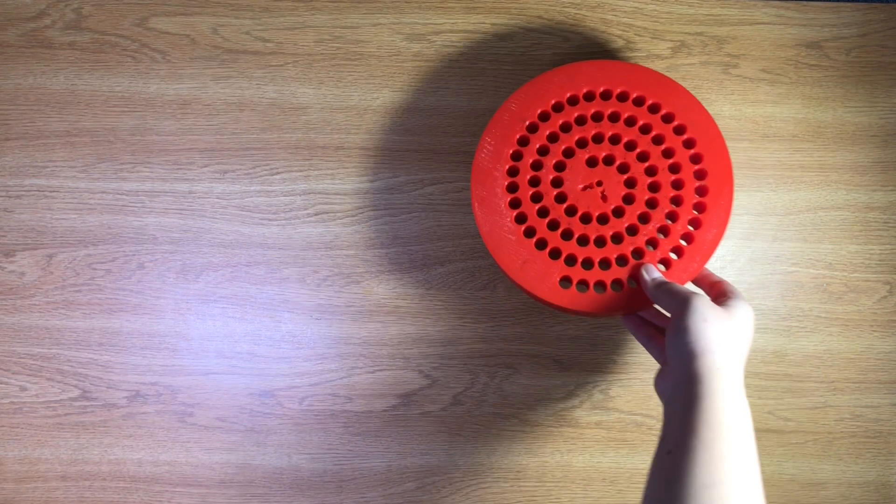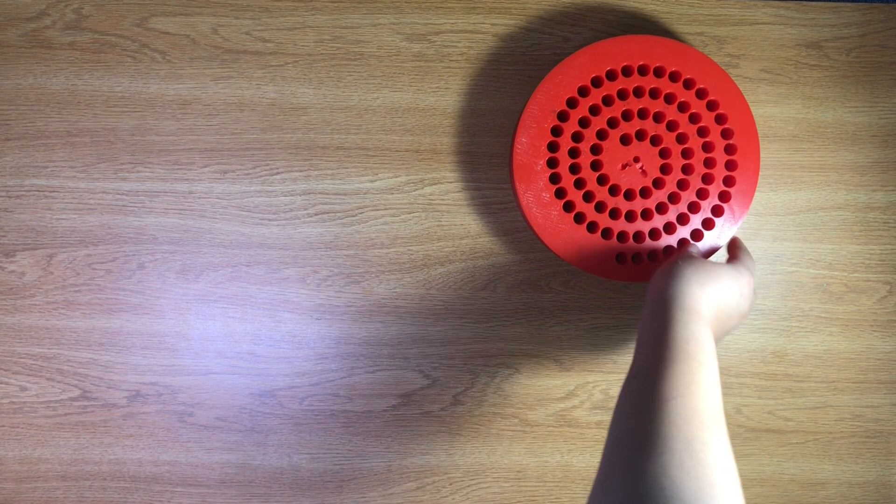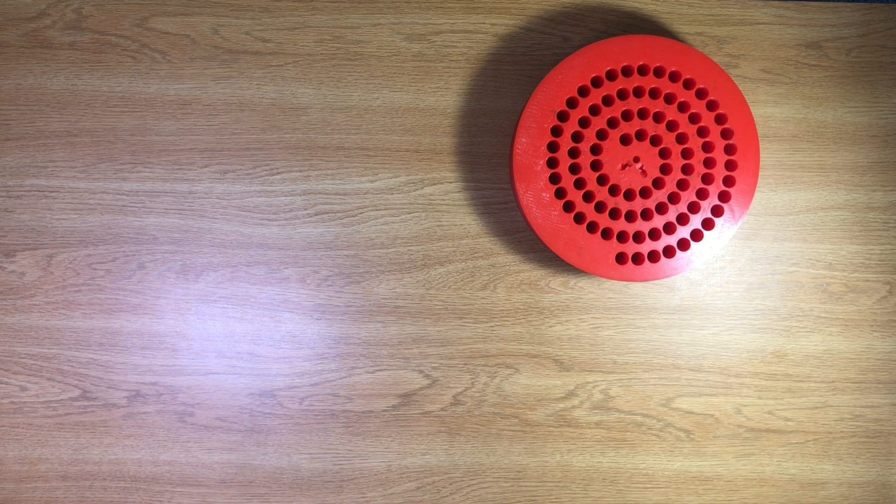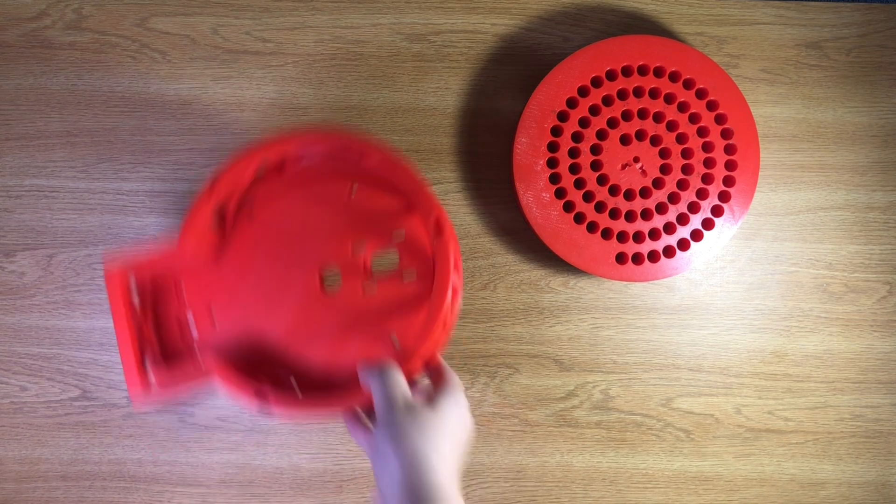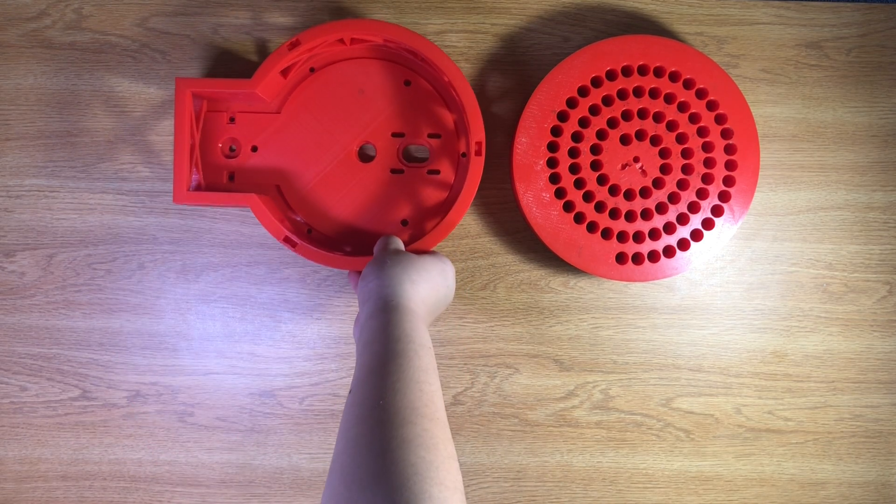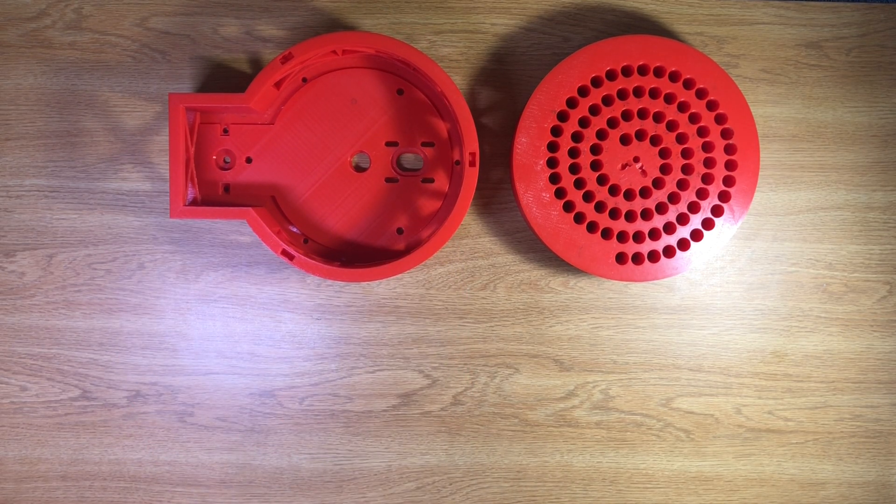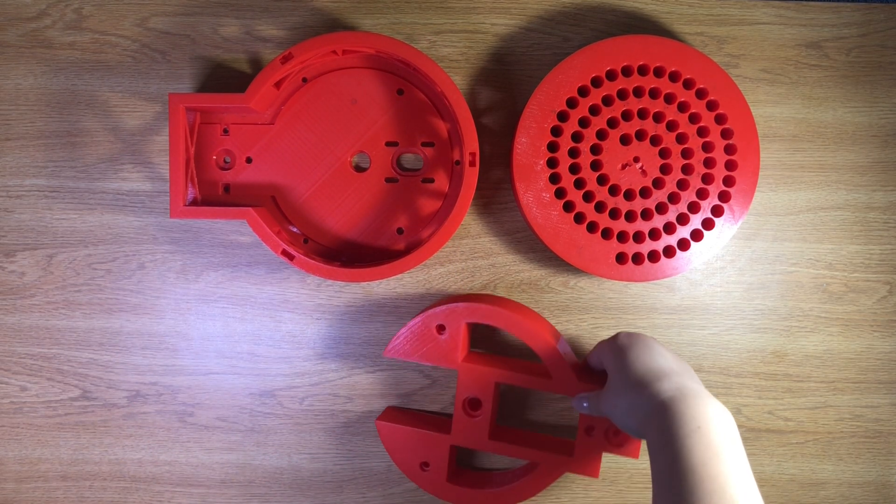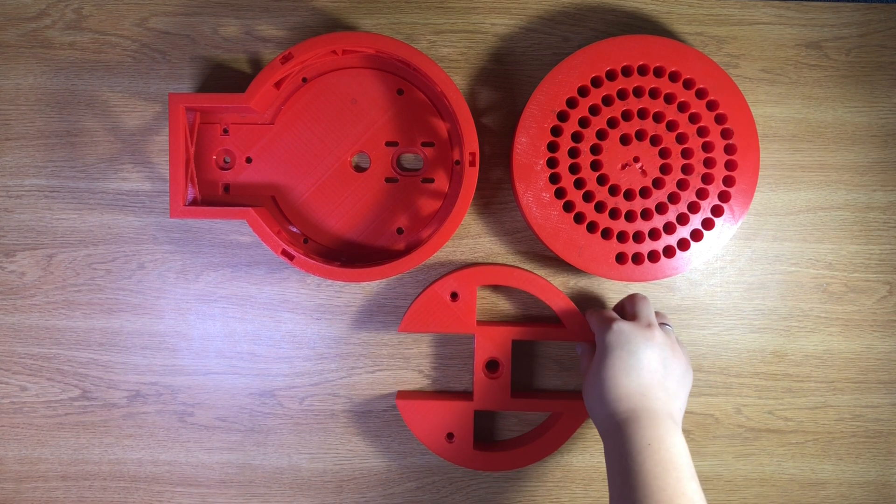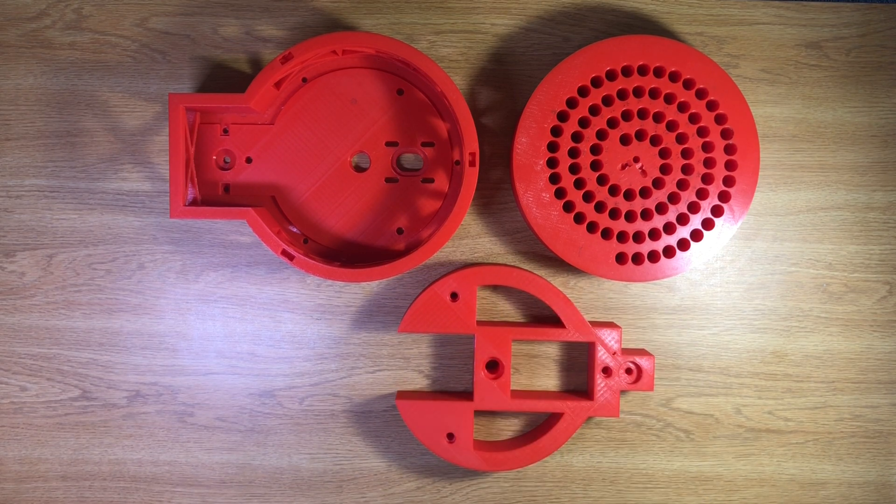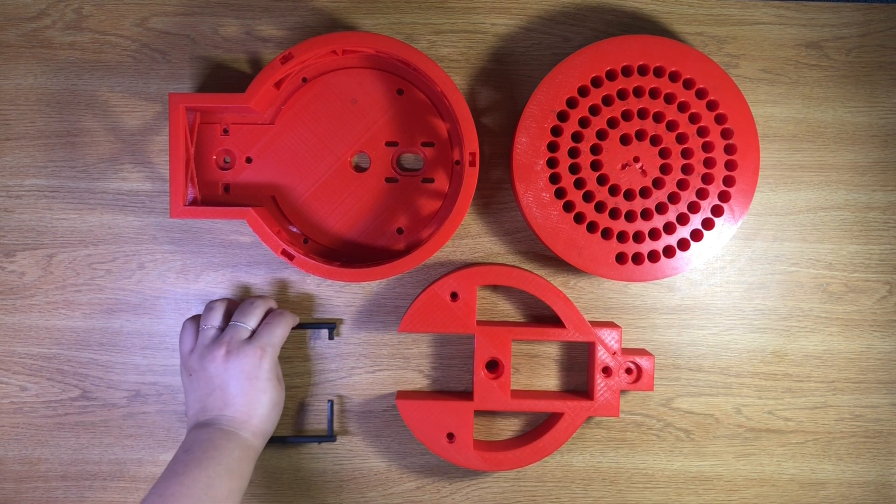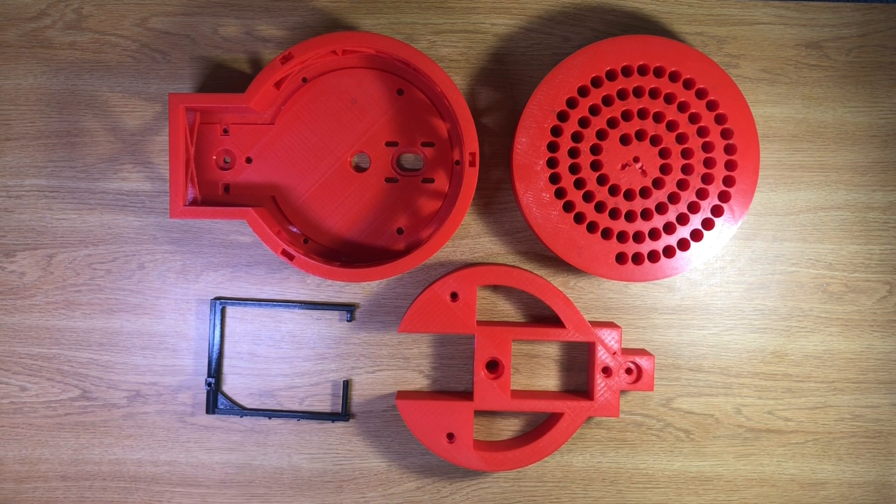Before you begin, make sure you have the four 3D printed parts: the tube bed, the base, the base plate, and the arm.